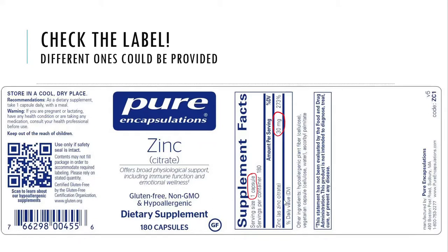Now, if this said two capsules and 30 milligrams based on that serving, then I'm going to have to take 30 divided by 2, and that gives me 15 milligrams. This is 15 milligrams per tablet. And the reason I'm saying that is because the dissolution system that we're going to be measuring this with is a vat, and that vat takes one pill, not two pills. So one pill gets dropped down into the vat, and that one pill should release everything that it should have in it. And in this case, for this particular brand, it is a 30 milligram pill.